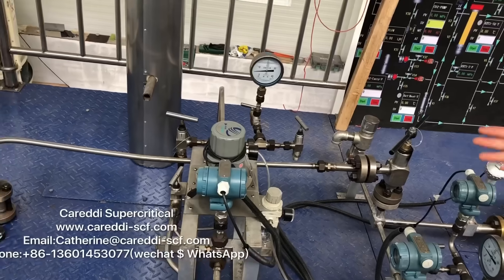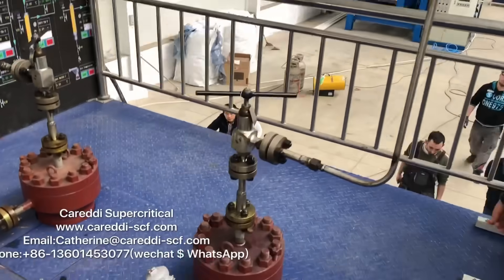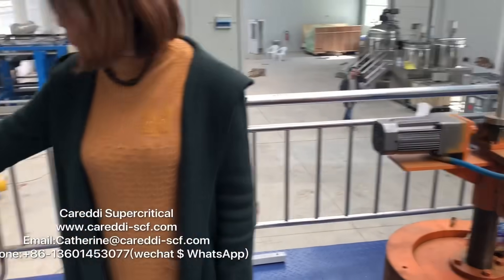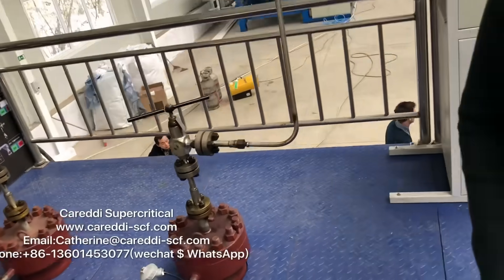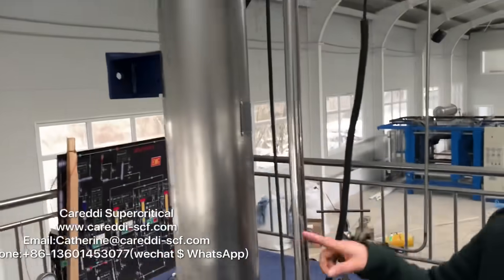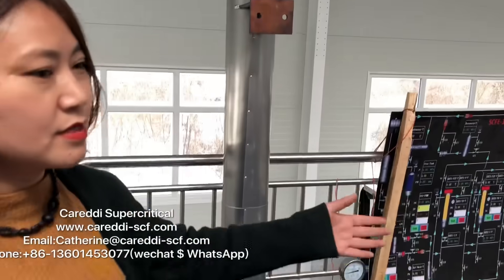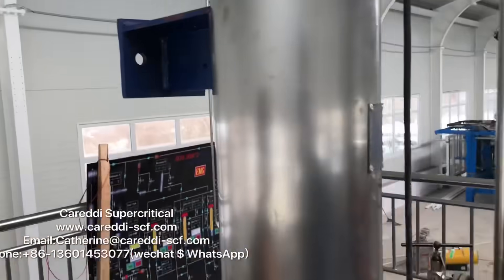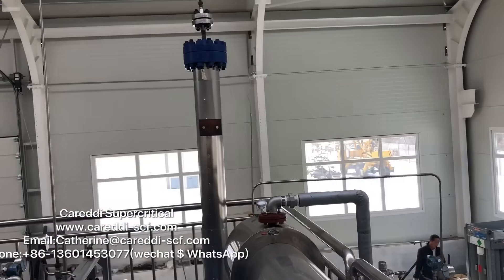This pressure regulator is for controlling the pressure of the separator. These two vessels are the two separators. This is the heat exchanging system for separator 1 and separator 2. That heat exchanging system is for the extractor vessels.